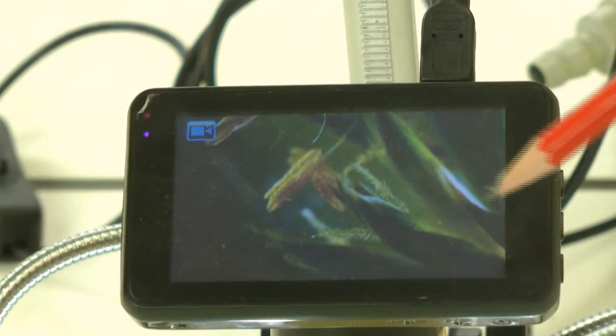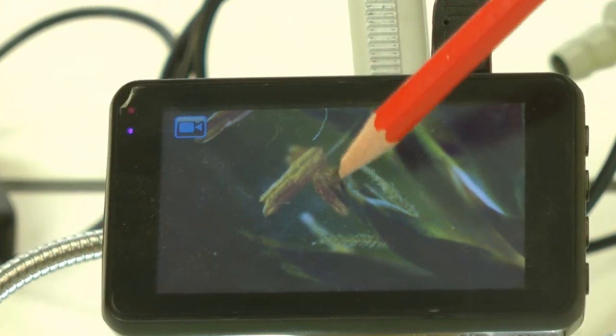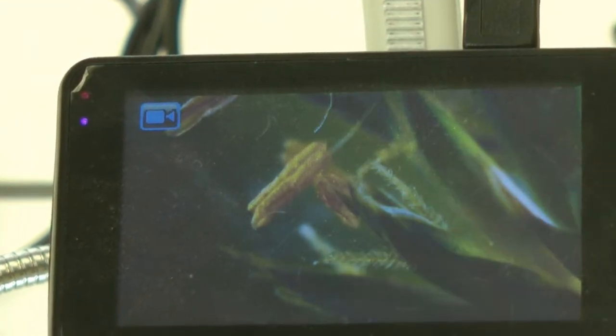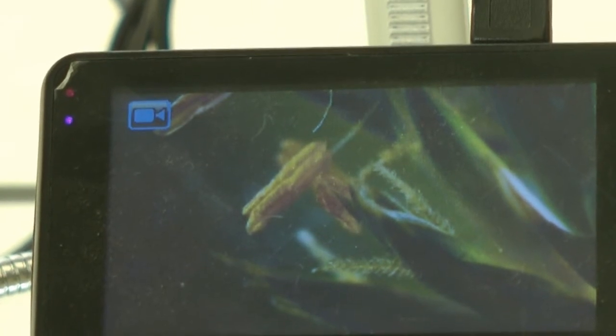So here you can see the stigmas and the anthers which have come out of the flower in the inflorescence. You can find all the parts of this flower in your plant biology book. So I want you to identify all of those when you draw it.